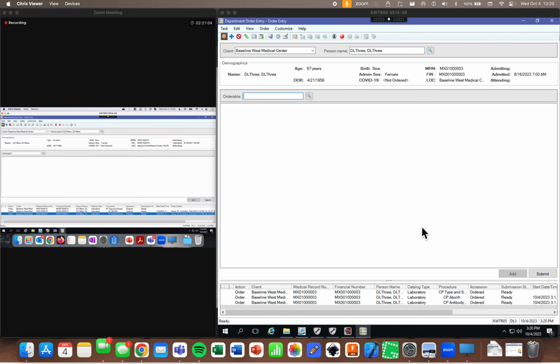And this hopefully goes without saying, but since the whole point of this adventure is for us to test the build that we've been working on, make sure that you're using your build items, the ones that have your initials on them, and not just the standard ones that are built in the system. I had someone a few classes ago that did that, so they had to go back and do the whole thing again. Which is fine, it's more practice, but definitely a bad time.